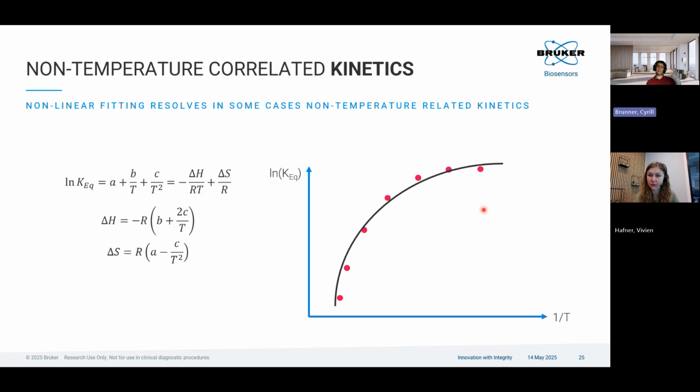The degree of complexity obviously increases pretty quickly. So this is kind of the easiest additional case where it becomes a simply shaped curve. It's just an additional term that you need to add to the equation, so a square term. Then this is doable. This is now one of the solutions for that specific case.